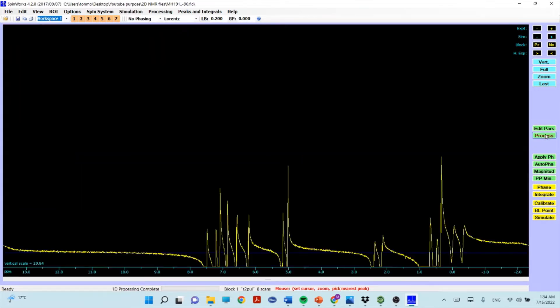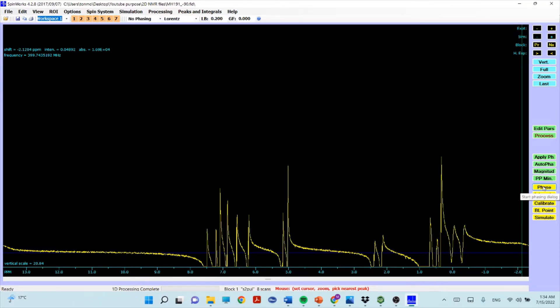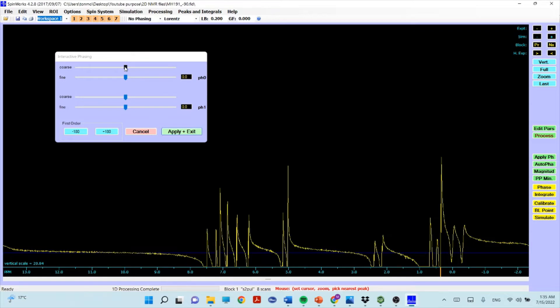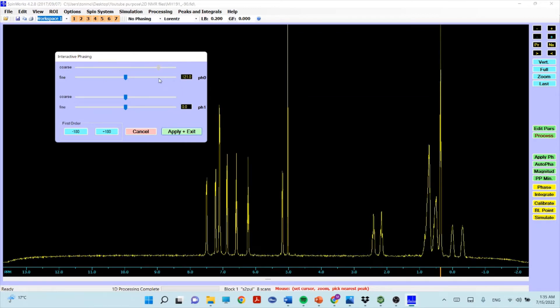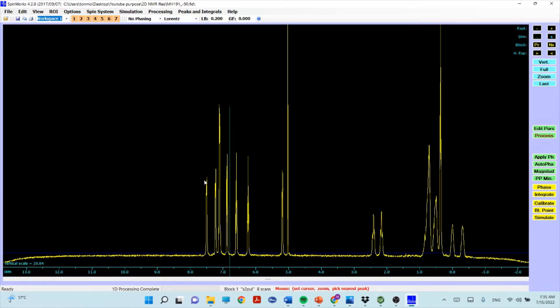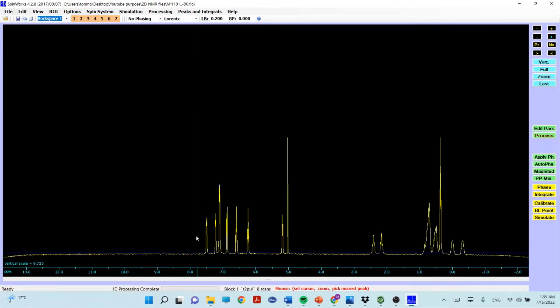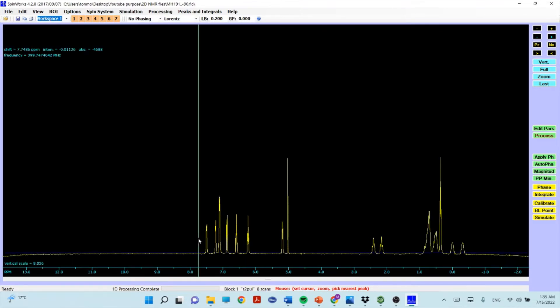After processing, the phase may not be corrected. Click the yellow Phase button on the right side. You'll see two cursors — remember one, two, three, four: use cursor one and three. First adjust the top cursor to get the correct spectrum shape; sometimes only adjusting that one is enough. Once done, click Apply and Exit.